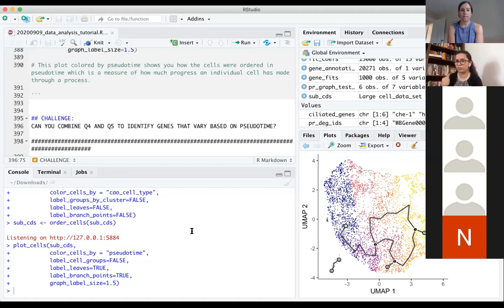You can plot them, you can download them as a CSV file and then plot them in violin or box plots or whatever you like, but you can also plot them in a UMAP. This again takes a lot of time, clubbing the two, because you need some output from graph autocorrelation and some output from the trajectory analysis, club them together and then get your final result.